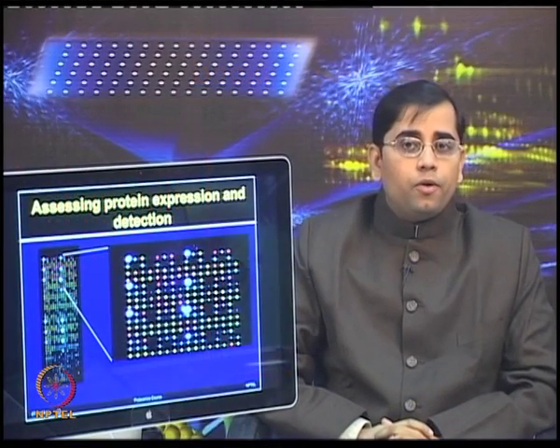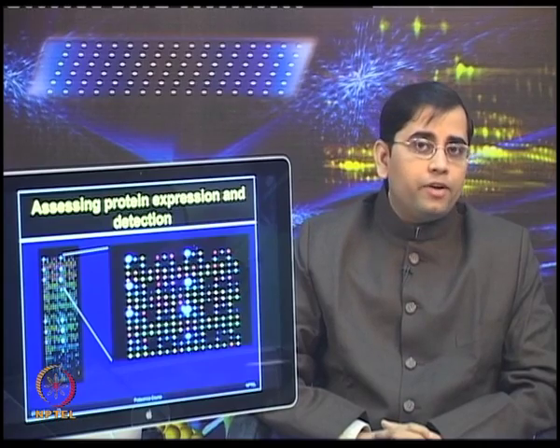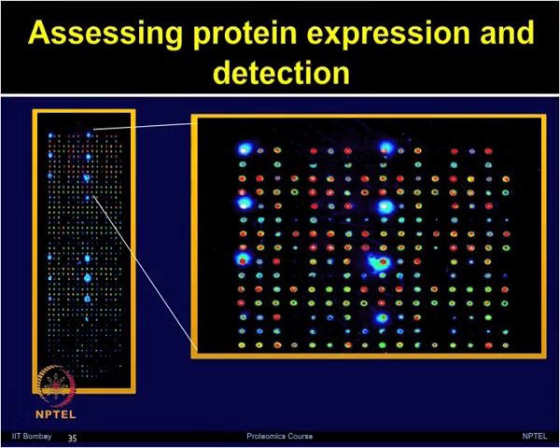Now, if you are looking at different types of immunological response, biomarker discovery, etc., you need to ensure that IgG is printed at varying concentrations to assess the immunological responses, such as I mentioned for screening human biomarkers.